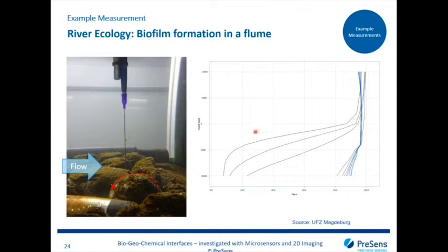If you have done such a profile series, what you can do next is actually use the profiles themselves to perform so-called flux measurements by using linear gradients, and by applying Fick's first law of diffusion, you can then calculate fluxes in and out of your two-dimensional system. Or if you do volumetric integrations, you can use it to calculate activity coefficients.